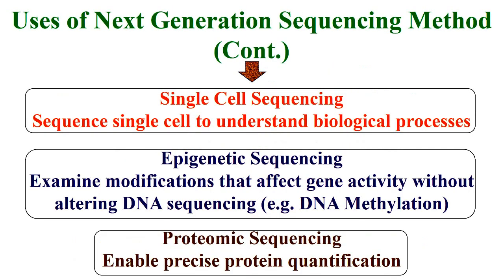And single-cell sequencing, to sequence a single cell to understand biological processes. And epigenetic sequencing, to examine modifications that affect gene activity without altering the DNA sequence, such as DNA methylation. And proteomic sequencing, to enable precise protein quantification.